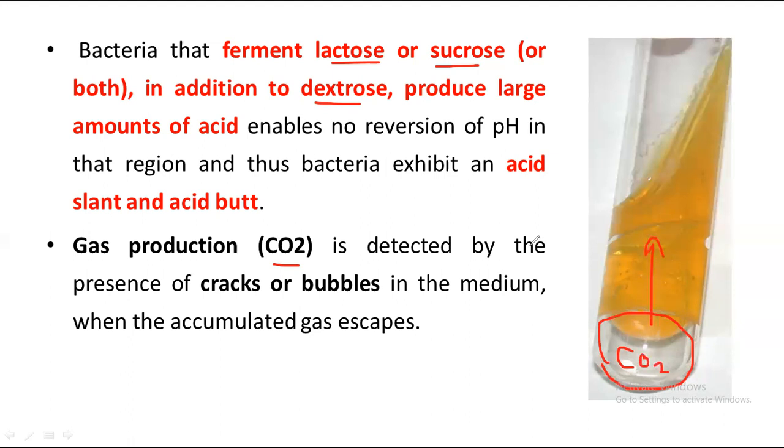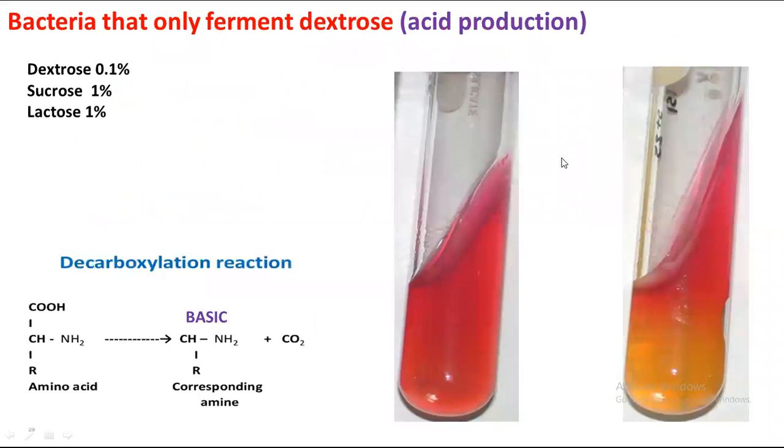And when you see this portion, you can easily tell that carbon dioxide is also produced. Okay, so hope you have understood this result. If you get such a result, it is a bit complicated one. Just to open your ears, because this result is a bit complicated.